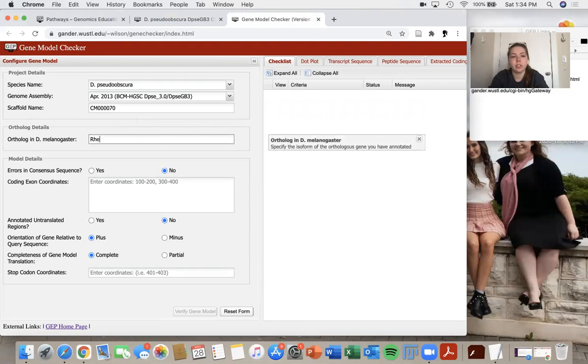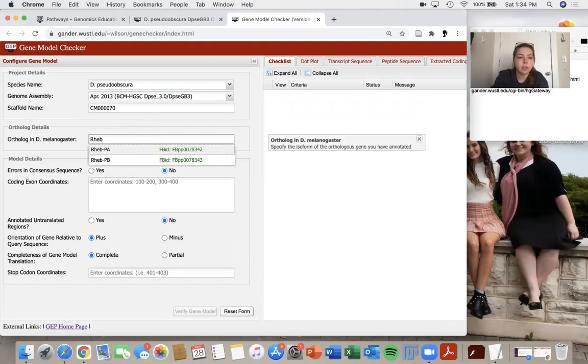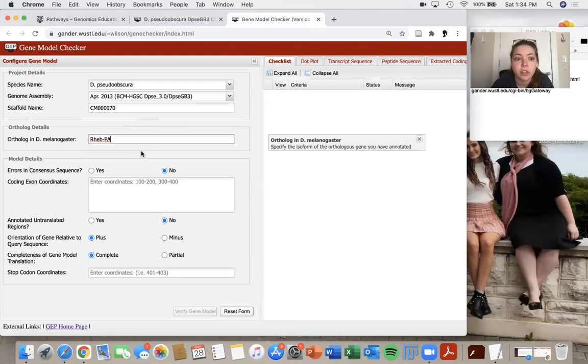So I'll click on that one. And then my ortholog name is RHEB. I said I was using the PA isoform. So that's what I'm going to choose.